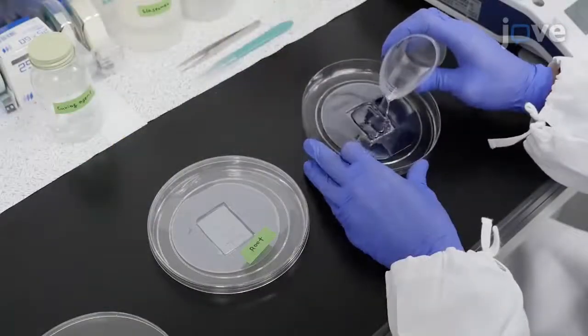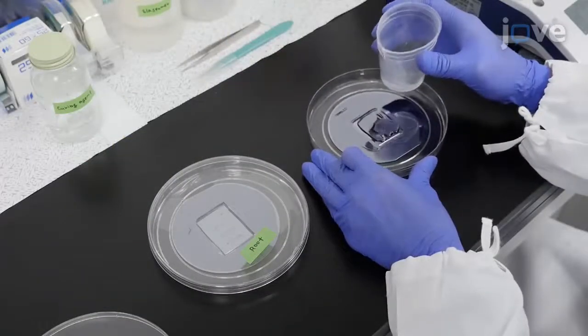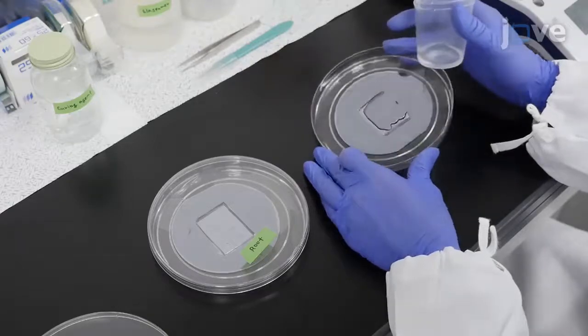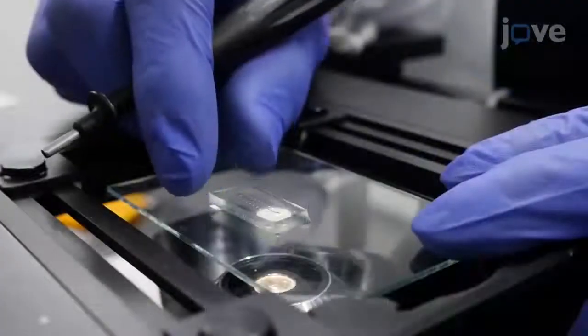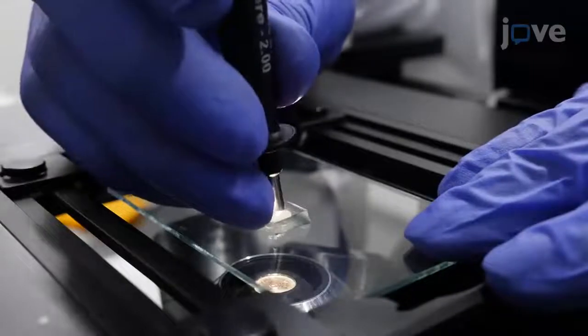To make a micro device designed for root hair examination, two molds are loaded and cured. When punching out the channel holes, use a 2-millimeter punch.